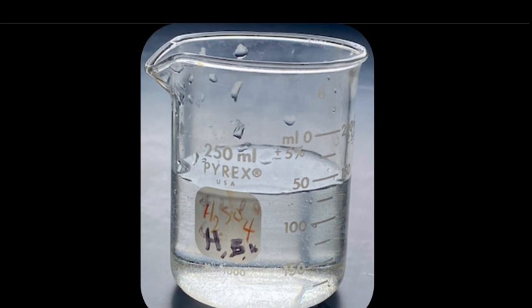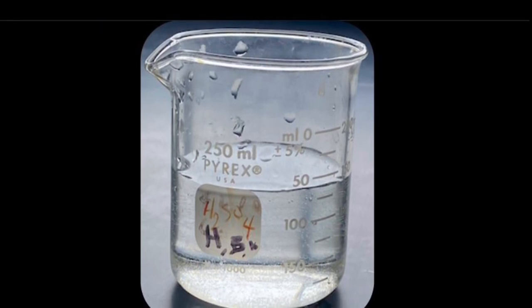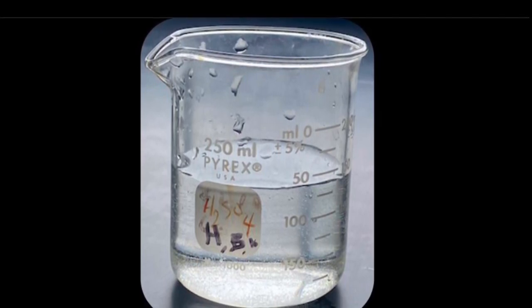I'm going to be talking about the information you need to know before using a beaker. A beaker is a piece of glassware used in a lab setting. Its purposes include measuring, heating, and stirring elements.